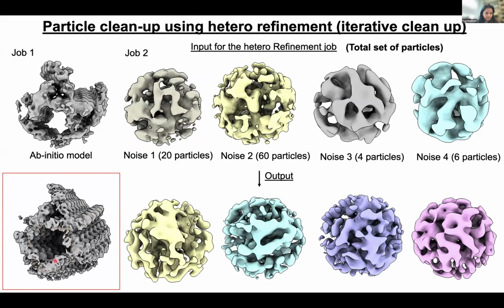We see that 5 of these trigonal filament assemblies are coming together and forming this pentagonal filament network. This is the front view, and here you can see the side views. As we solve the structure, what we see is the tilt along the central axis of filament 3 now brings this magenta TIR domain above the plane of the rest of the filament, and that gives rise to a pentagonal spiral bundle, and that spiral bundle can be extended in both directions again along this green double-sided arrow.